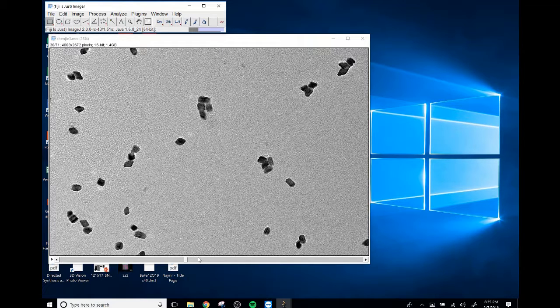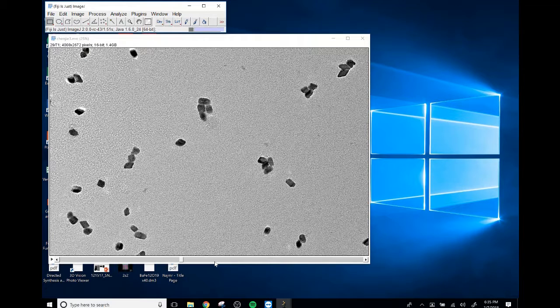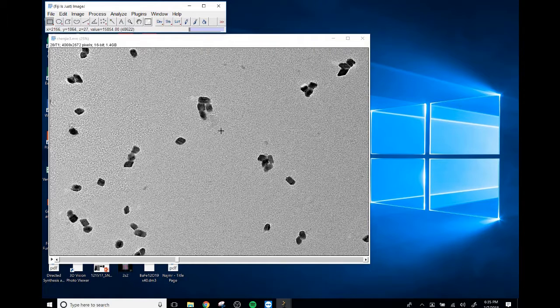The reason this is important is that if you move around this cursor while it's processing, you might end up applying the translation to the wrong slice. And that can lead to problems later on when you're trying to post-process it. So it's better not to touch it while it's doing its thing. And this will take some time.